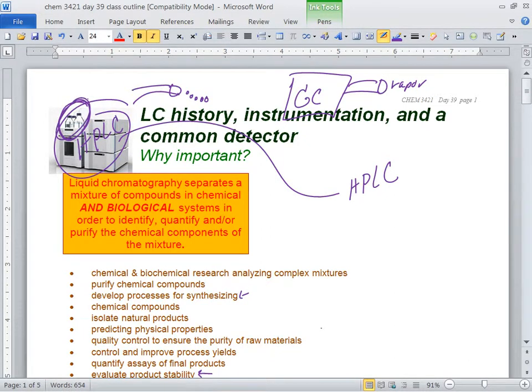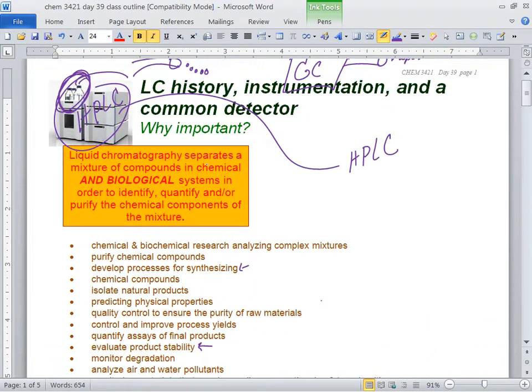And then all those solvents, you can kind of see the little tubes coming out. They're going to a valve, and it can suck out different proportions. So at the push of a button, or on the computer you can set it up, it can change the composition of the mobile phase on the run. And that's how you do chromatography with HPLC. That's how you do gradient runs. That's how you do the separation. You could go through all the work of changing columns and things, but that's really going to slow you down.